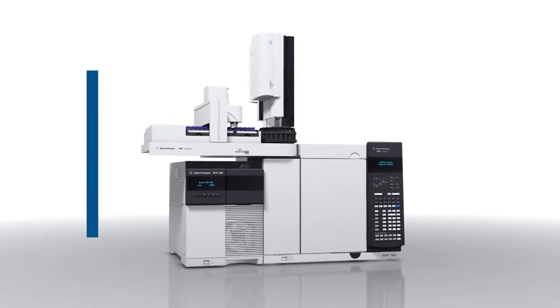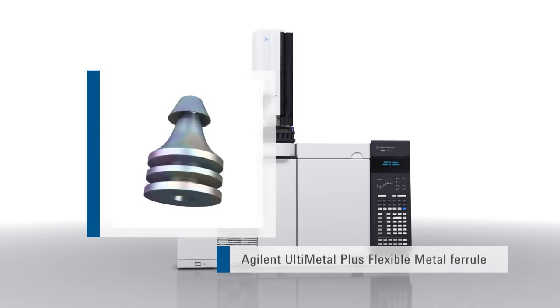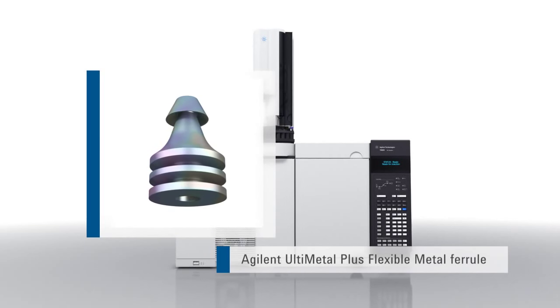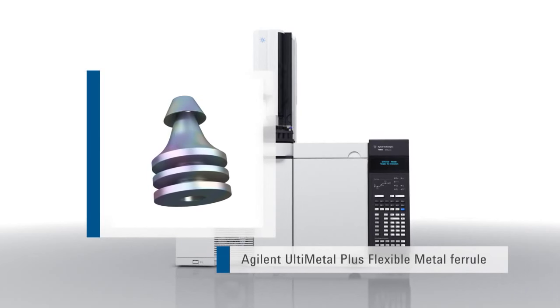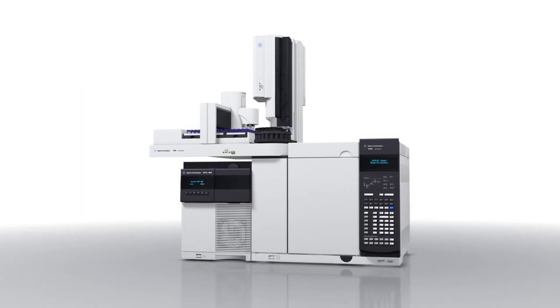An alternative to soft graphite polyimide ferrules are Ultimetal plus flexible metal ferrules. Designed for use with Agilent capillary flow technology devices, these are gaining popularity in other applications including the split splitless inlet.